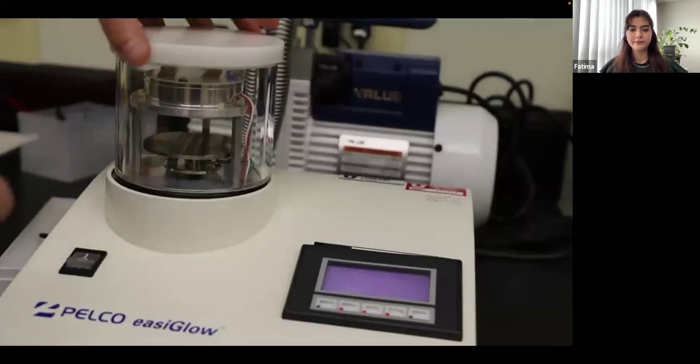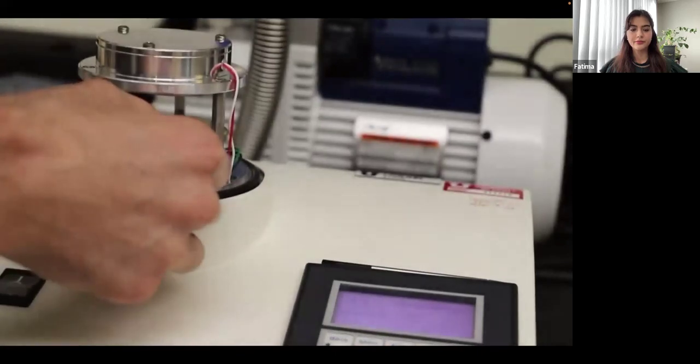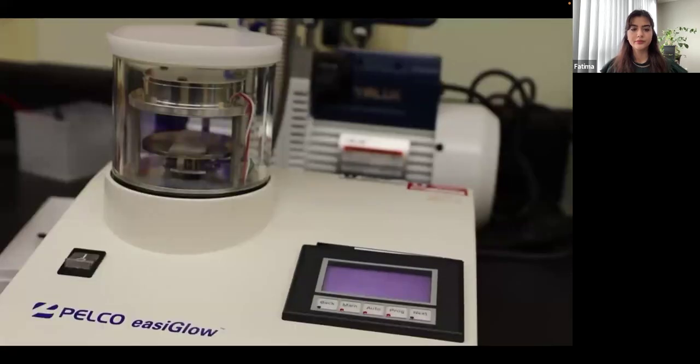Virtually every cryo-EM project is preceded by evaluating the particles of interest using negative stain TEM. This relatively simple and quick method enables users to gauge particle quality and provides a first-order estimation of the feasibility of their cryo-EM project. First, we need to prepare the grid by glow discharging. The surface of the grid is carbon-coated and tends to be hydrophobic. Glow discharging will make the surface of the grid hydrophilic, allowing our sample to spread easily.